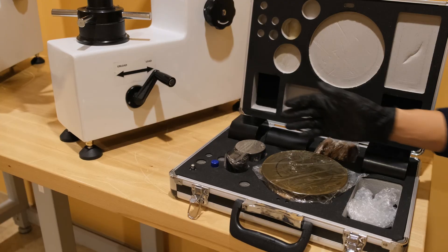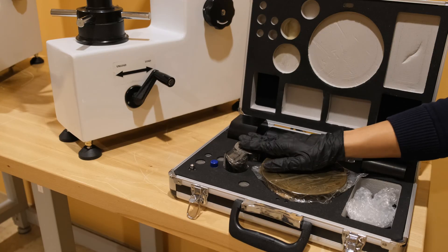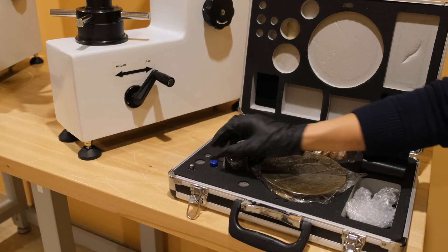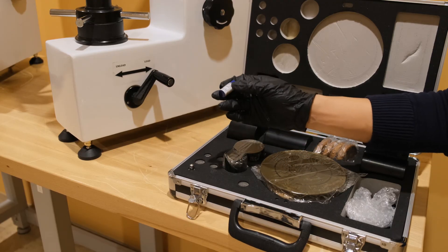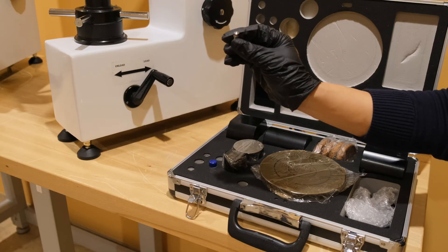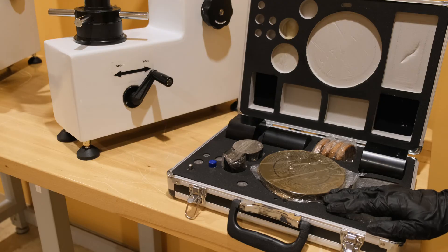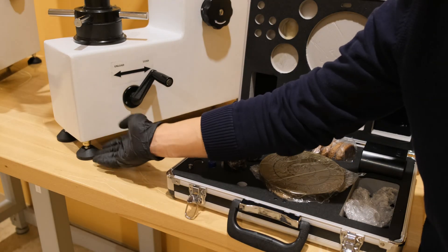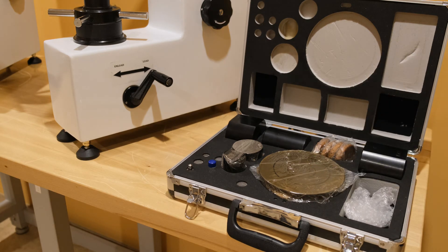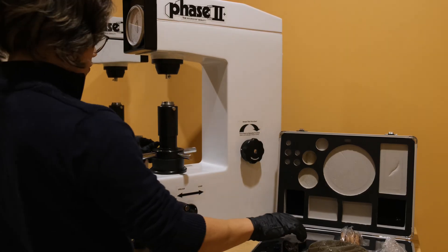Inside the kit for the 900331 you will find a set of weights, four test blocks, anvils — small, large, and V-shaped for rounded parts — a 120 degree cone indenter, and a 1/16th inch ball indenter. The kit additionally comes with a set of four feet which have been attached to this machine for leveling purposes. NIST or ASTM certified test blocks and penetrators are available on request.